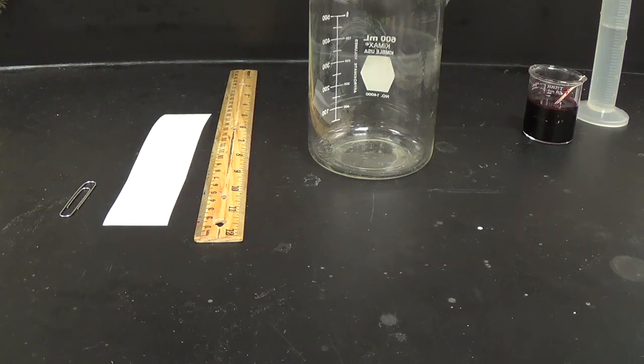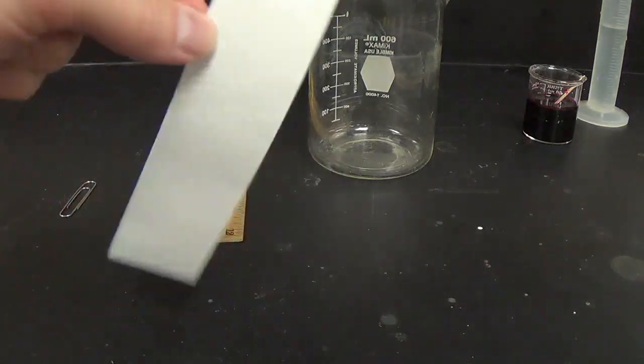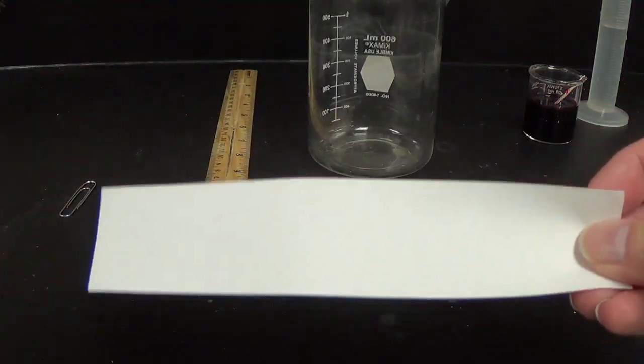actually start paper chromatography, because what you need to do as soon as you get to class and we get started is to set it up so it can develop as we discuss how it actually works. So you can imagine with paper chromatography we need chromatography paper. This is a special paper, not unlike coffee filter paper.